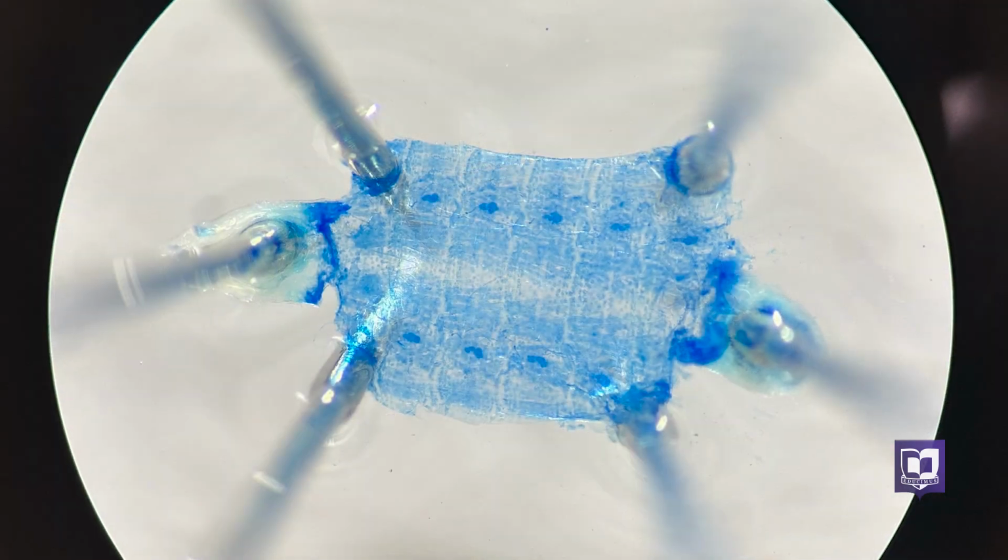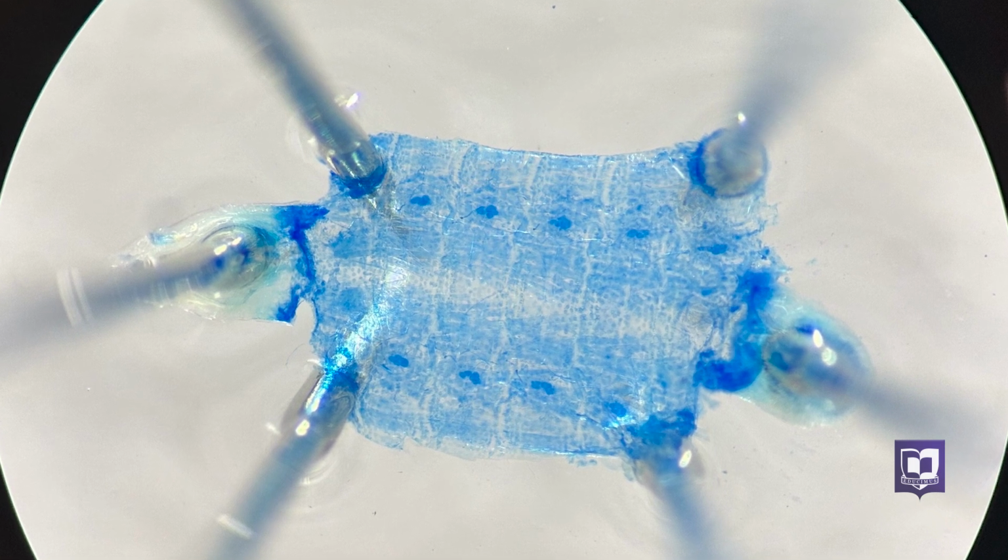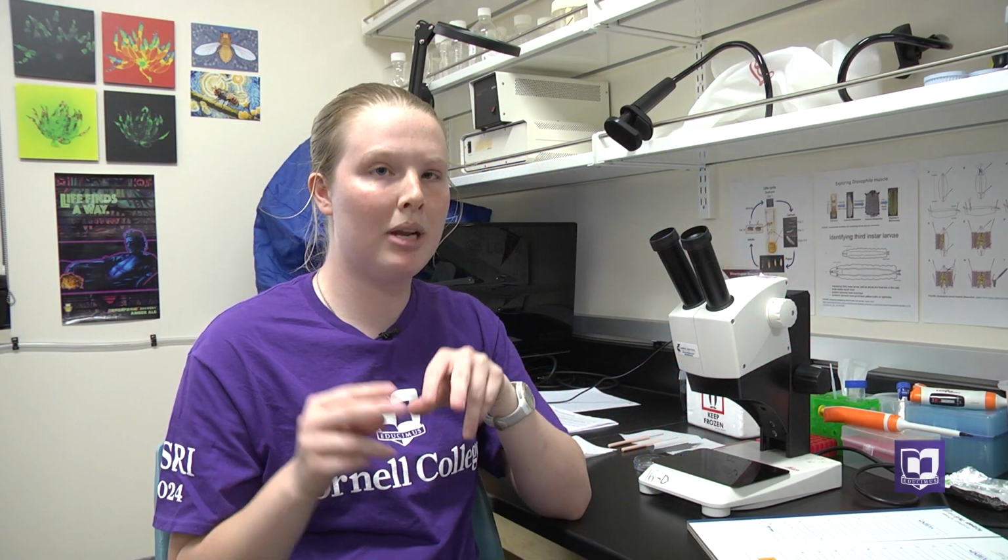For example, when we're dissecting the larvae, they're clear, so it's really hard for me to cut, but we found out that we have this methylene blue that I can stain the larva with, and it makes my cuts clear, and so I can more easily go in there and dissect.